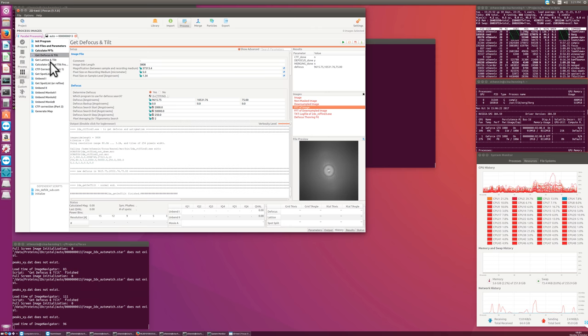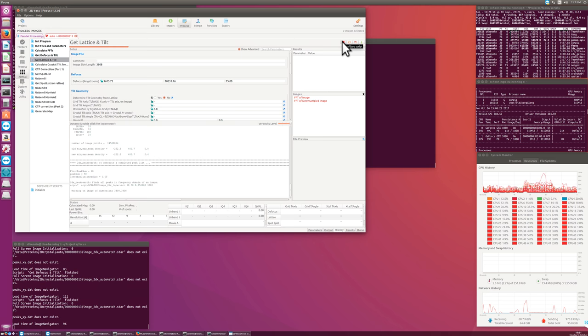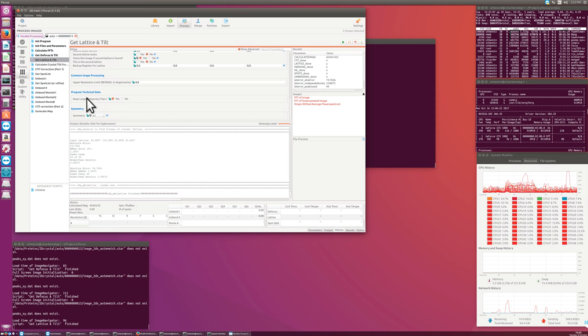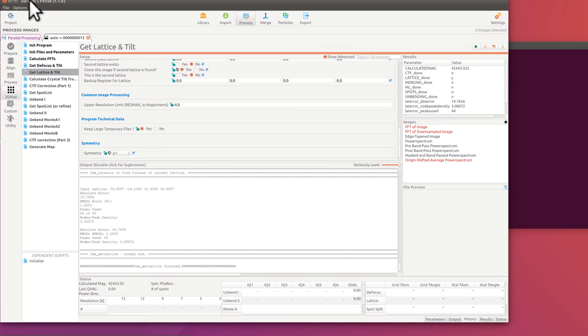And if you would click on Accept, then these values are taken over into the database. But I just click on Reload to have the original values back, because they look nice. The next thing would be the lattice determination. And this is something that usually, with the first image you want to process, it fails. And what we do here, let me just switch on that we see all the temporary files here. Keep large temporary files. And then I run this again and we see a bit more.